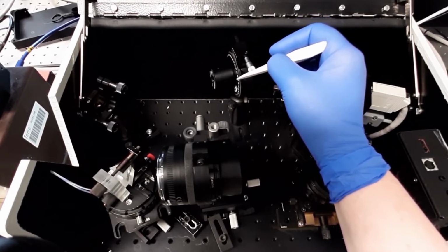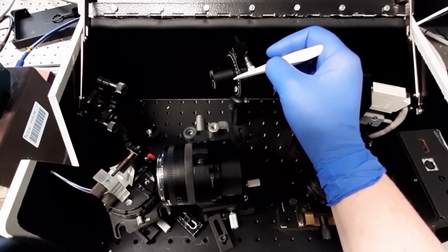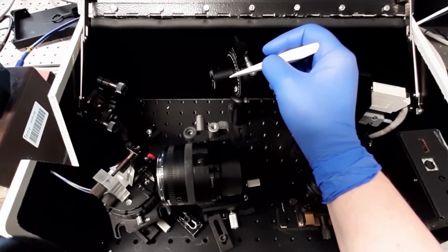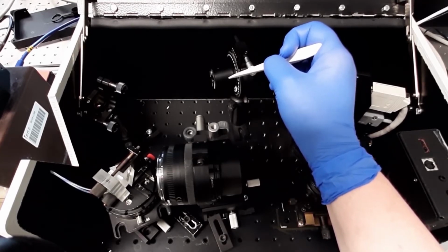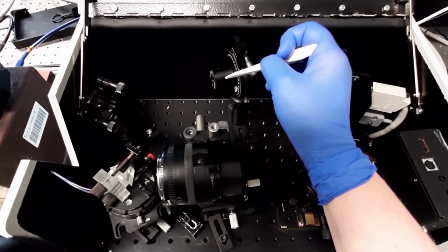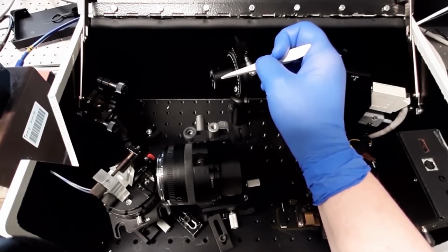Polarized light is the prerequisite for the plasmon wave excitation, which occurs in the gold film of our gold sensor chip, and which actually serves as a basis for the detection of viruses and virus-like particles by our sensor.